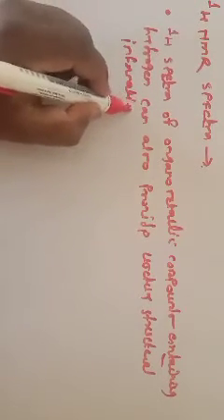So what information is obtained from this H1 NMR spectroscopy?